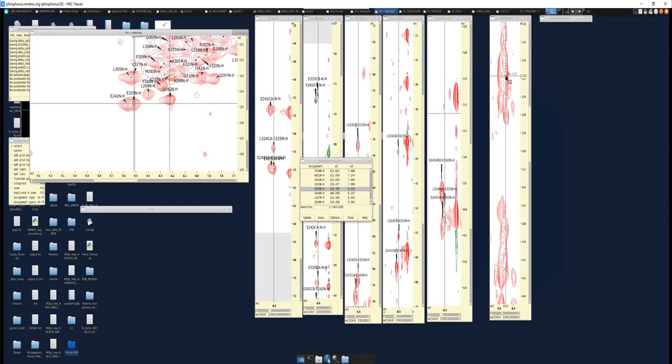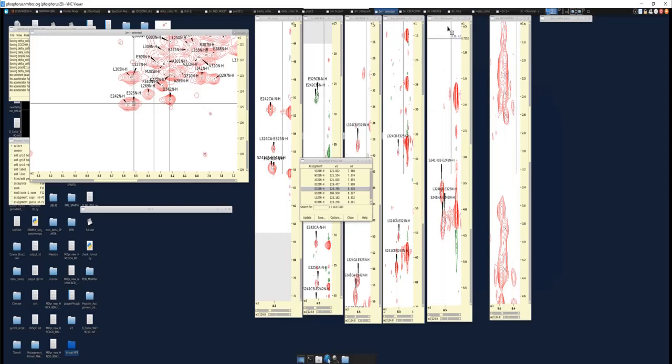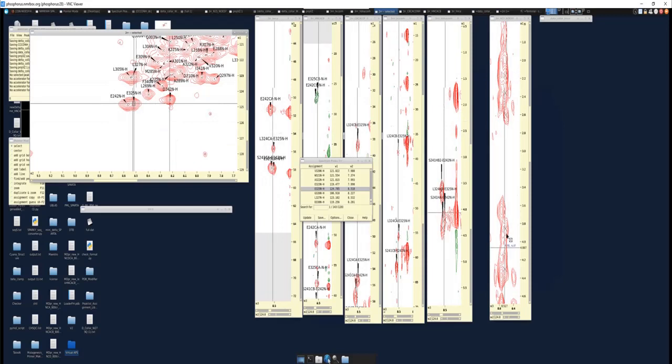The NOESY can look at any hydrogen through space, so it doesn't necessarily mean they are the I-1s or I+1s. However, you know the HBHACONH is definitely the I-1. And so if the amide matches up, and the H-beta matches up, and the H-alpha matches up, that's a pretty good correlation right there that you're probably looking at your I-1 peak.